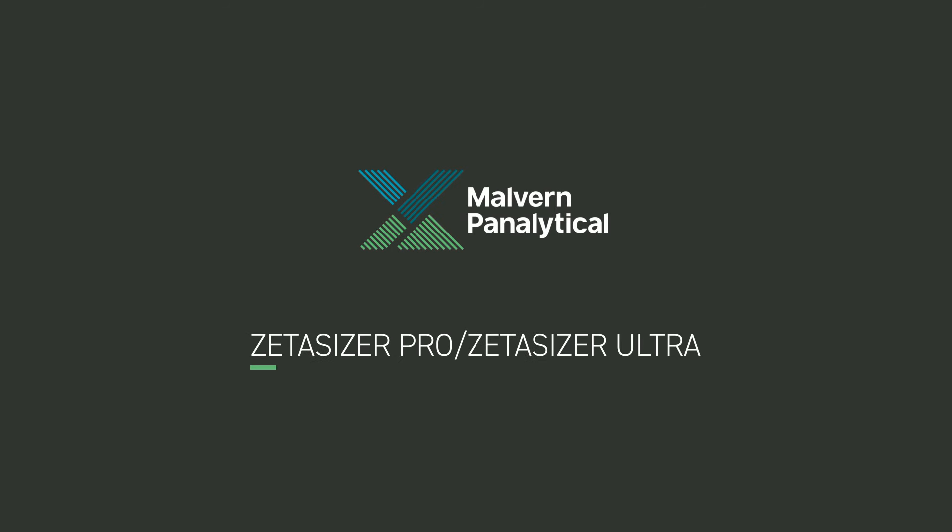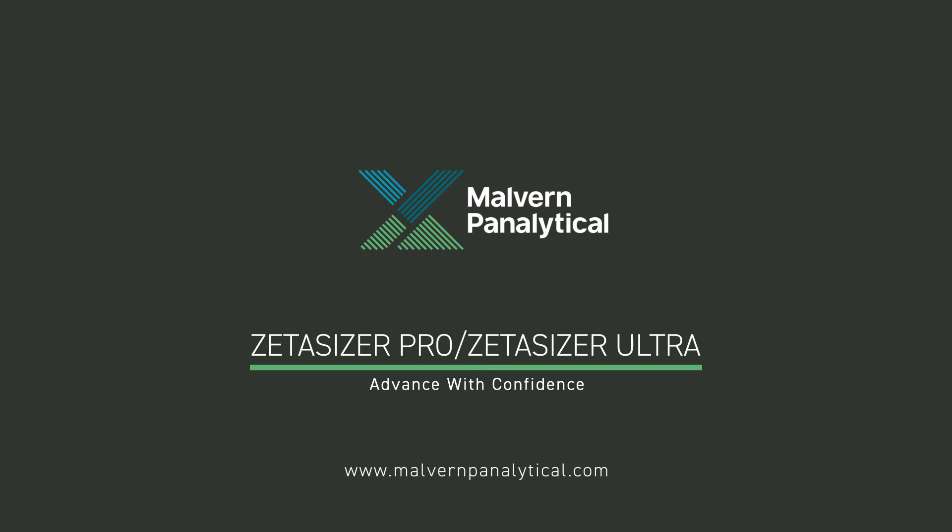The new ZetaSizer Pro and Ultra. Advance with confidence. Particle characterization you can trust. For further information, visit us at www.malvernpanalytical.com.